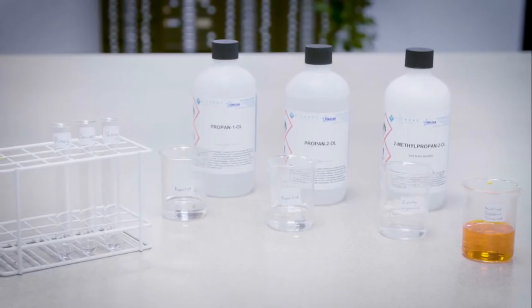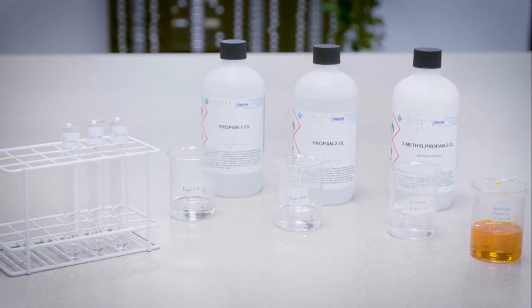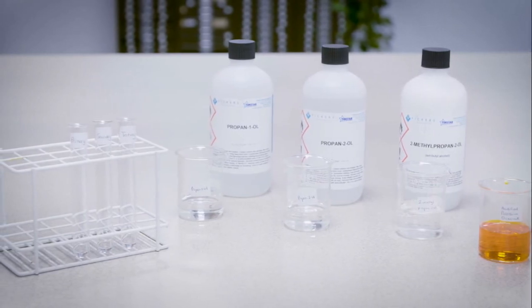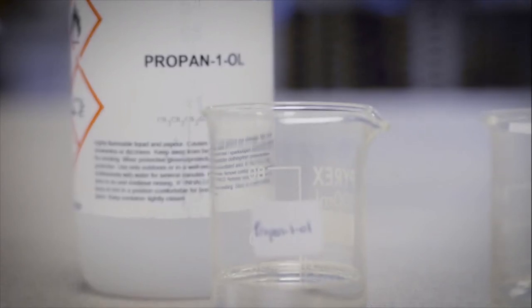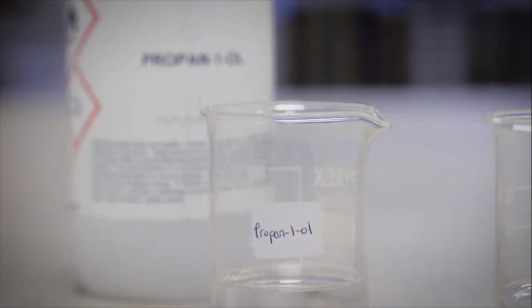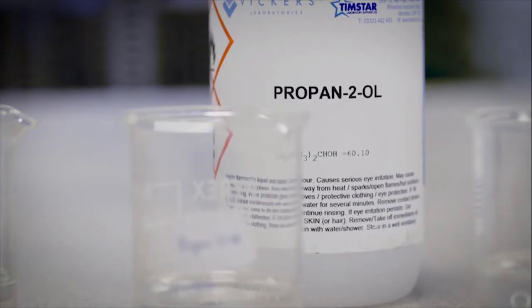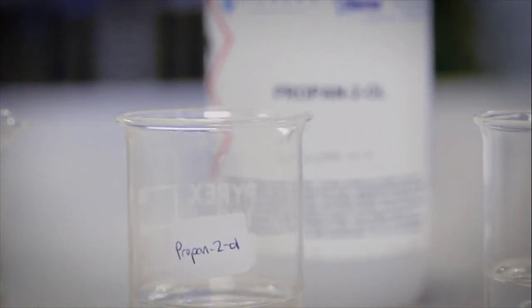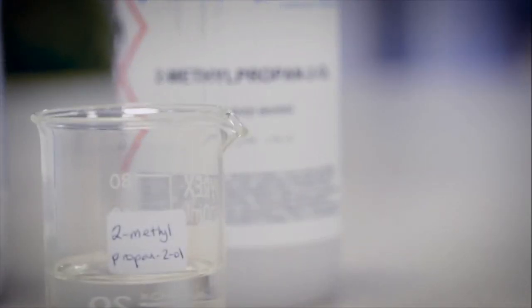For this test, the three test tubes should be labelled primary, secondary and tertiary. The primary alcohol used is propan-1-ol. The secondary alcohol used is propan-2-ol. And the tertiary alcohol used is 2-methylpropan-2-ol.